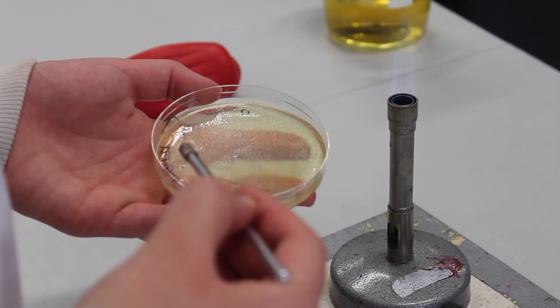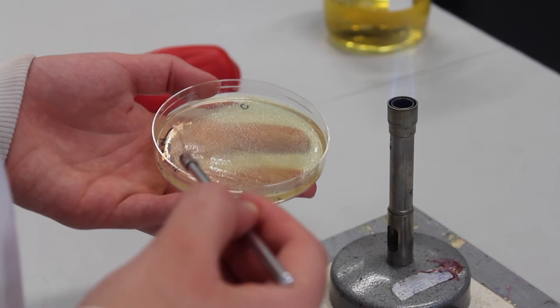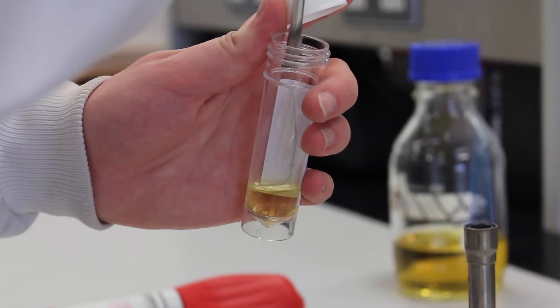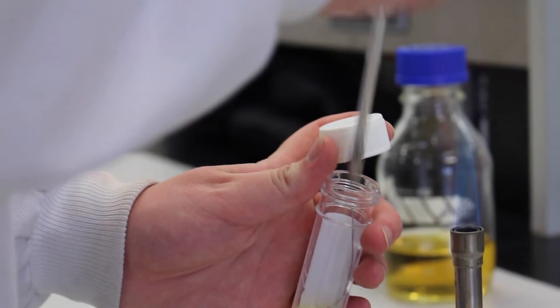The loop is further cooled on a part of agar that does not contain colonies. A single colony is then scooped up. The colony is transferred to the tube containing SOB medium.